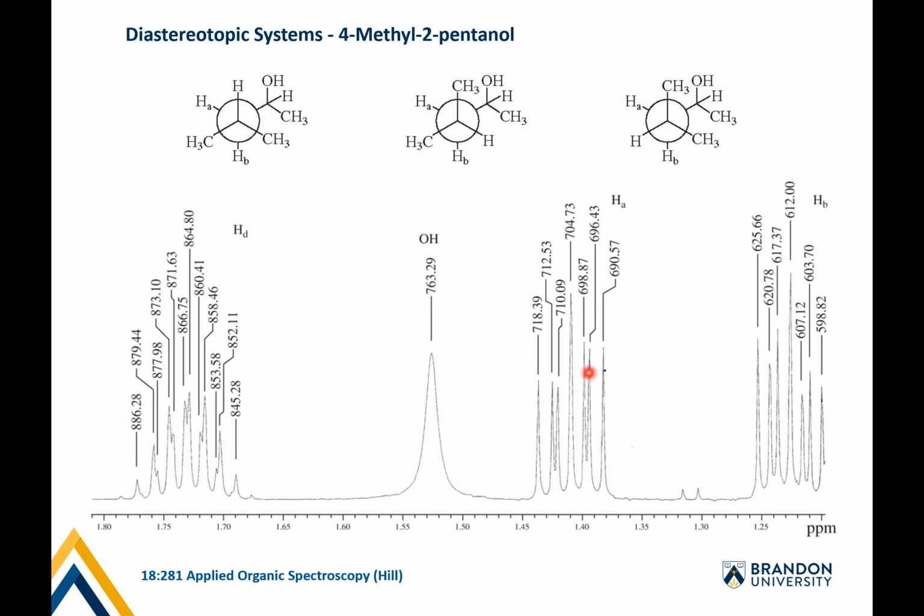These 3 are slightly taller, and this one in the middle is the tallest. But it doesn't fit at all with our Pascal's triangle of how coupling works. And over here, you see a very similar pattern as well. 1, 2, 3, and then a bigger peak in the middle, and then 3 smaller peaks on the end. So there's 7 peaks, but they don't resemble anything.